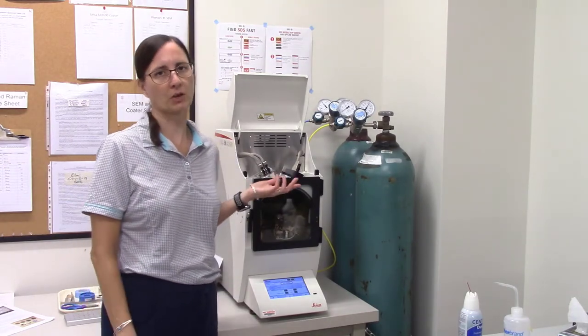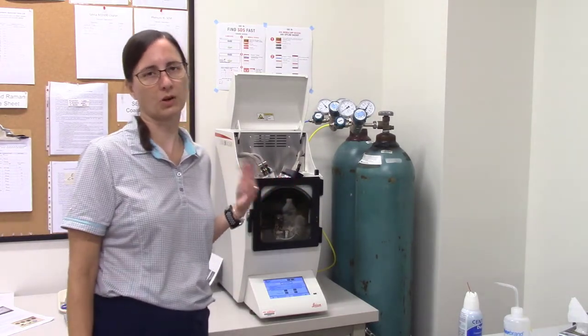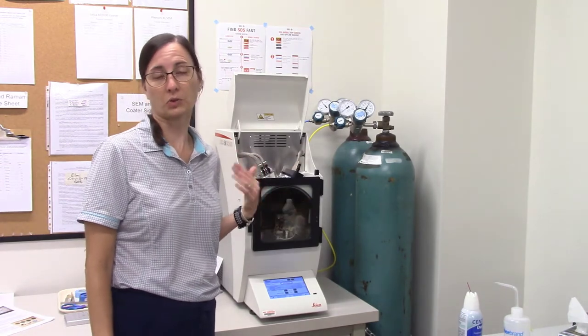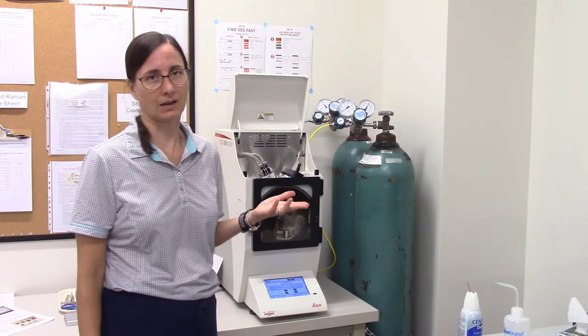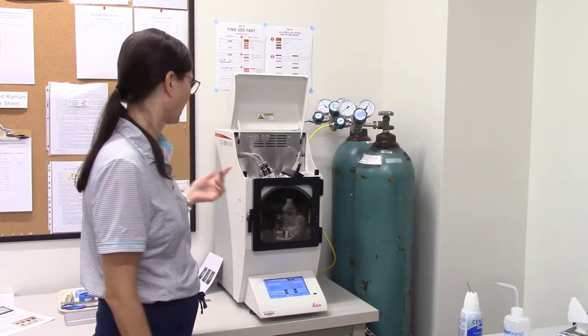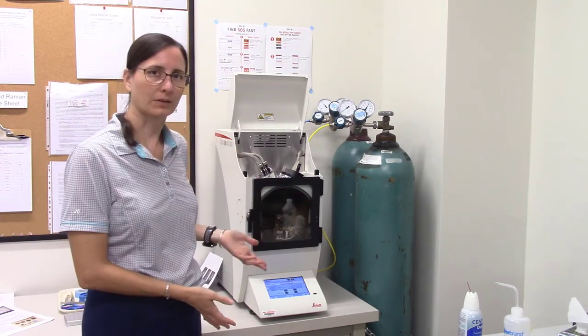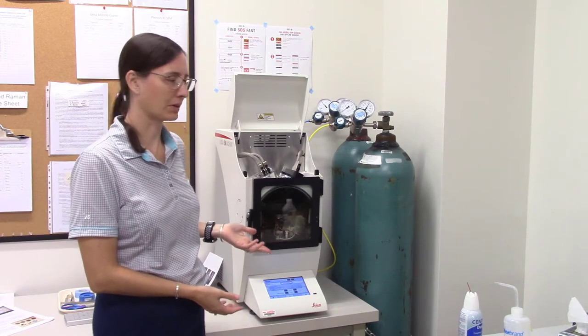Hi, this is the carbon coater we're going to use at JMU to coat our thin sections or thick sections or samples for things like the scanning electron microscope. Let me go over the parts of the carbon coater here.